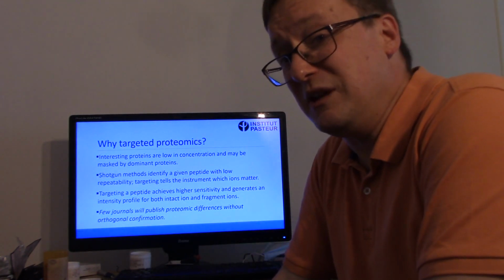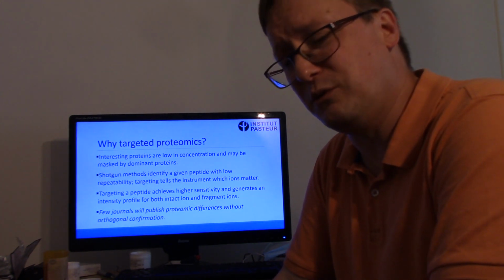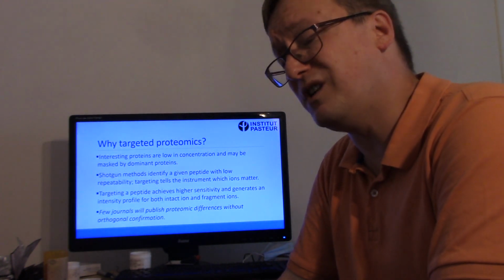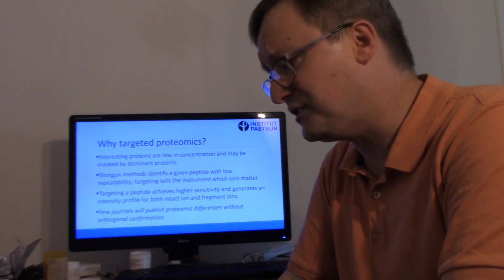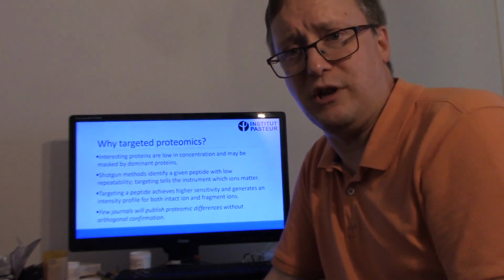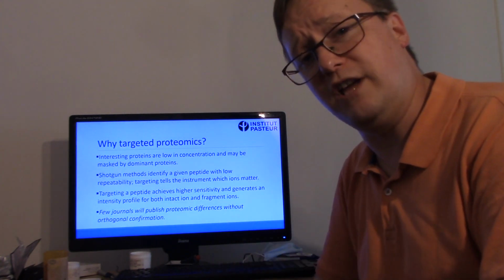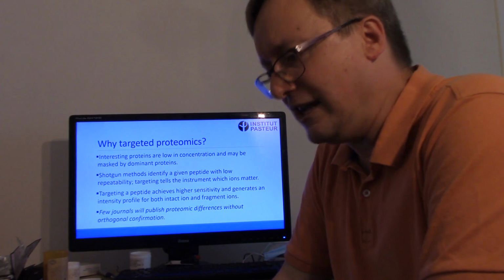I am talking about something much more limited in scope that has a very long heritage attached to it, and that is very much the way to go if the number of proteins you're interested in quantifying is, say, 50 or less. If you want to quantify 1,000 proteins, this is not going to get you there. But if you want to quantify 50, it's much more robust and reliable than a lot of the other techniques we could talk about.